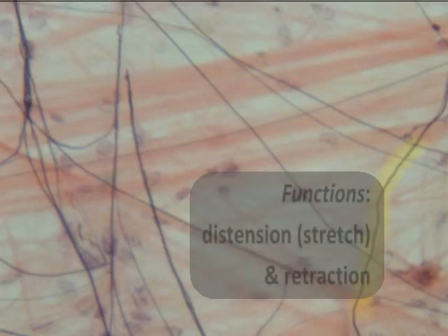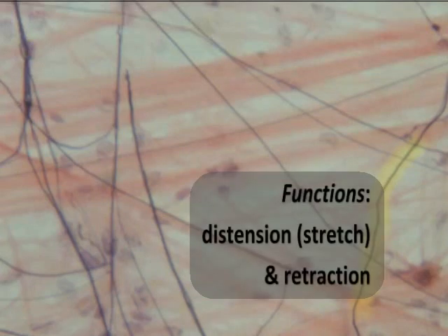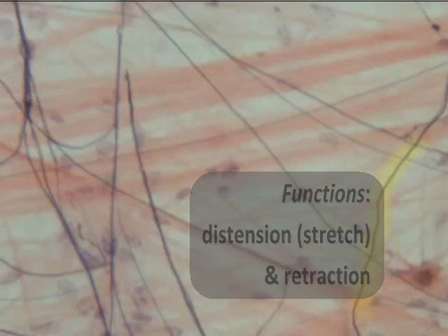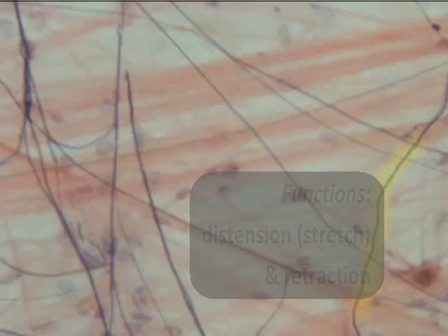We also occasionally have some elastic fibers — we see here some of these proteins that sometimes appear like coils. The elastic fibers provide the ability to distend and stretch, as well as to retract and return back to the tissue's original shape, providing strong durability. We find areolar connective tissue abundantly throughout the body.